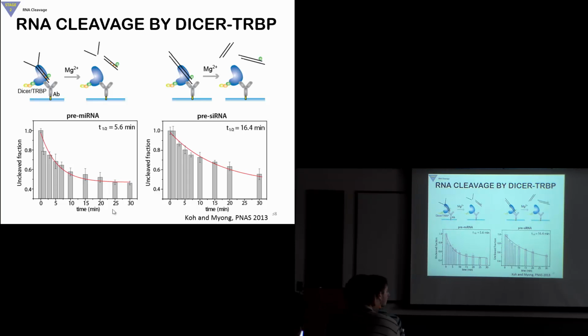You guys have a question? What's the typical temperature and pH when you use this? How sensitive is the method to each of those? So we typically use room temperature. All of these assays were done at room temperature. For some of the cleavage assays, we go up to 37, so it's typically between 22 to 37 degrees. For some proteins, we have to go up to the physiological temperature, body temperature, 37.